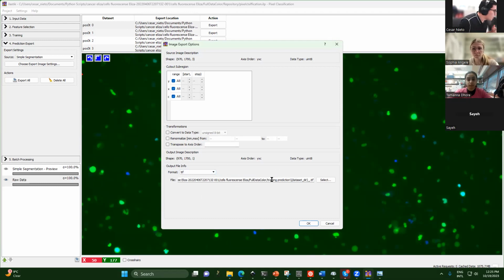Okay, let me check more carefully. Maybe next time I can explain better what happened here. I think maybe it's because of this space or something like that.